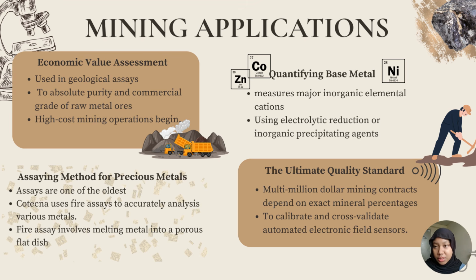Assay is one of the oldest and most traditional methods of determining the quality of precious metals like gold and silver. Cotecna uses fire assay for accurate analysis. Fire assay involves melting metal in a porous flat dish called a cupel and checking the purity of the metal.